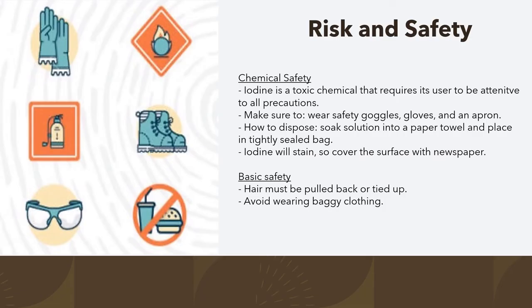As far as risk and safety goes for this experiment, it is really important to read the safety handbook for iodine to know how to properly dispose of it and know what to do if you happen to get it on yourself. You want to wash it off with warm water — it is a toxic chemical, so you want to wear goggles, gloves, and an apron. To dispose of it, you want to soak it into a paper towel and place that in a tightly sealed bag, as it's harmful to the environment and you don't want to pour it down your drain.